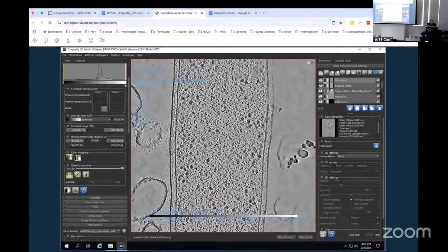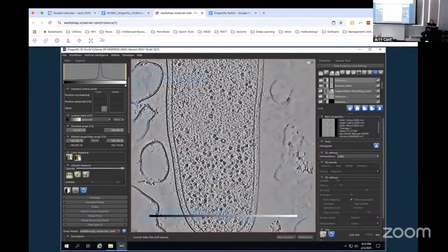Well, it's never seen any of this, but for instance, you see these two star-shaped objects right in the middle? Those are type 6 secretion systems, like the injection apparatus. It's certainly never seen anything like it or anything close. Well, maybe a microtubule. And you see this a lot with these networks, where I try to figure out where it's hallucinating, but it does a really good job of preserving structure for the most part.